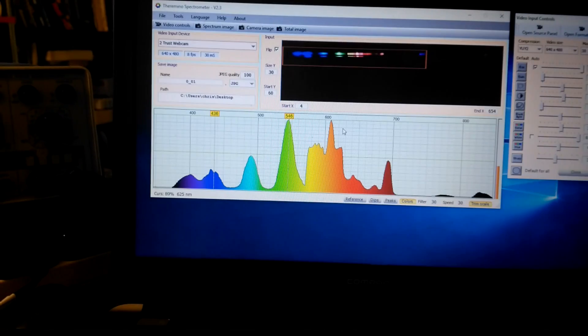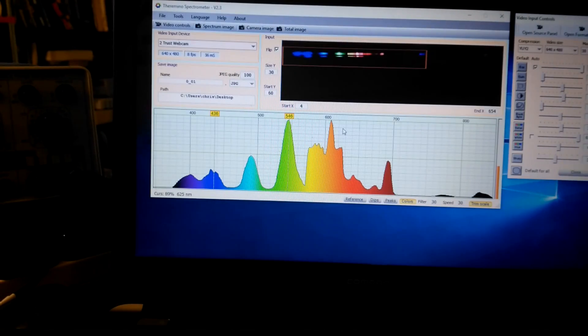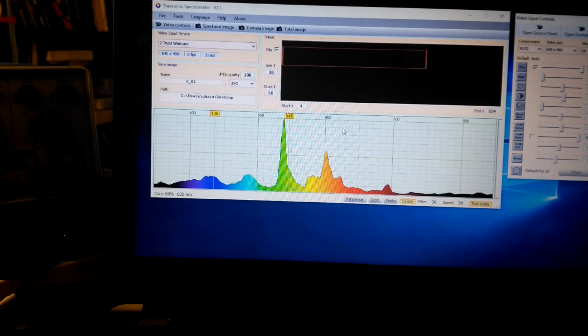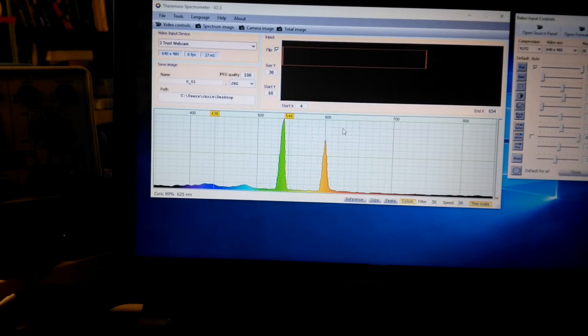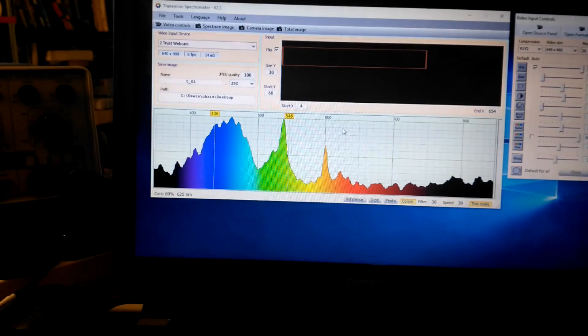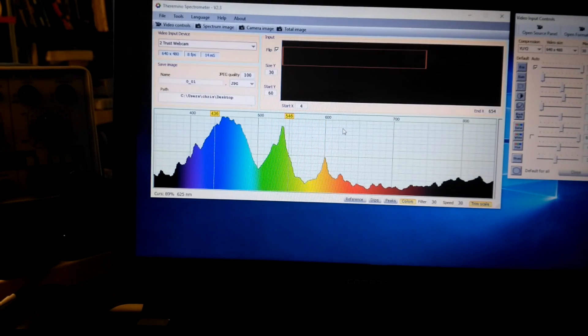So this is now calibrated, and we can expect that as we move the device to look at various different things, the spectrum that's revealed to us in the software is representative.